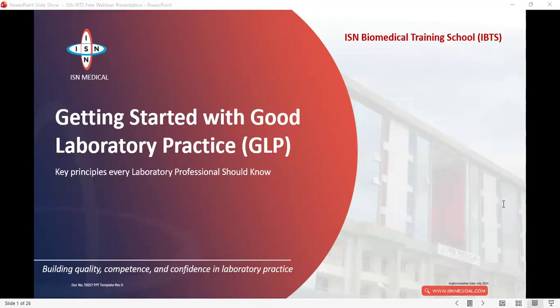So it will tell you that this is normal. If you rerun it, it will give you another number, but it will still tell you that it is in the normal range. And if it's not in the normal range, it will show you that it's not.